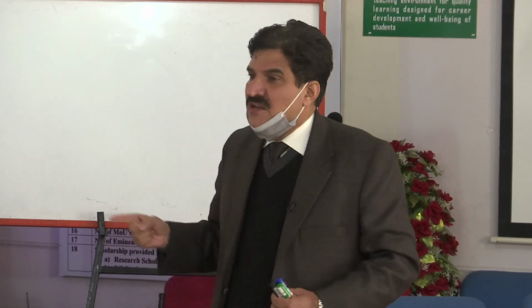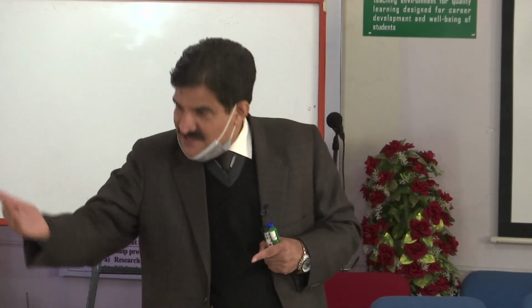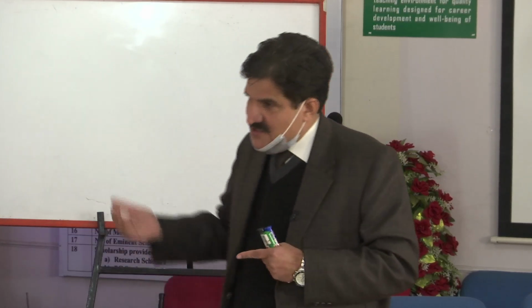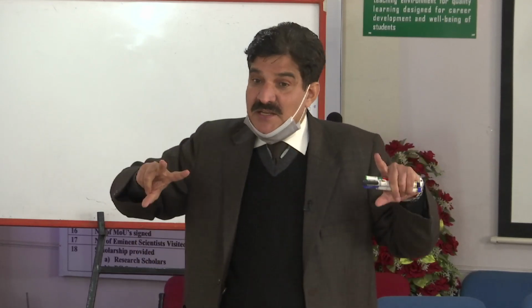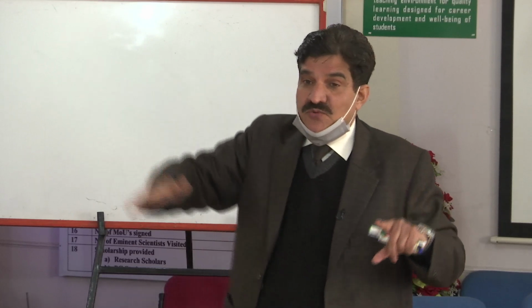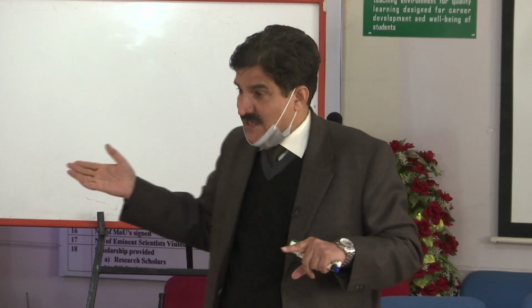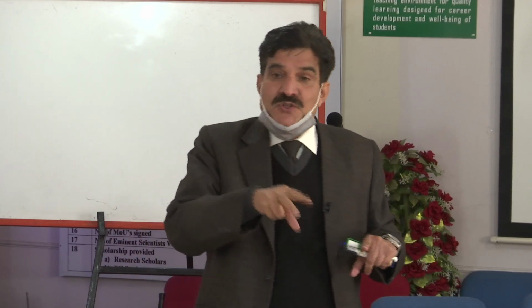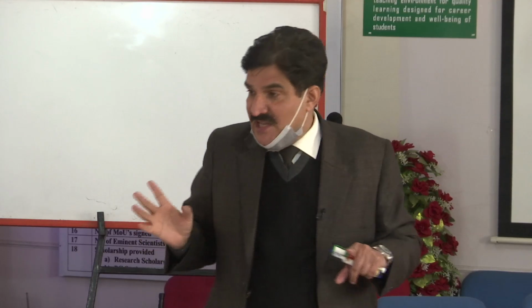And in general, we use SDS. I can use SDS in the case of plant systems, even bacterial systems also. It ruptures the cell wall because it contains one very big hydrophobic long chain, and negatively charged sulfonate groups on the other side. So it has both polar as well as non-polar nature, called amphipathic in nature.